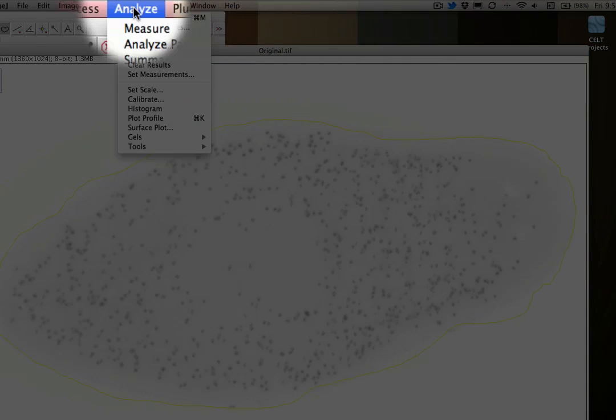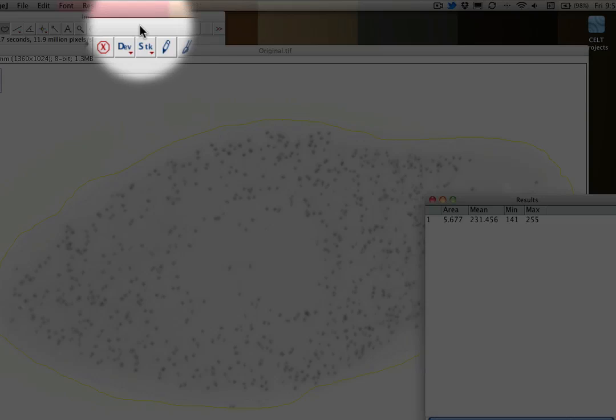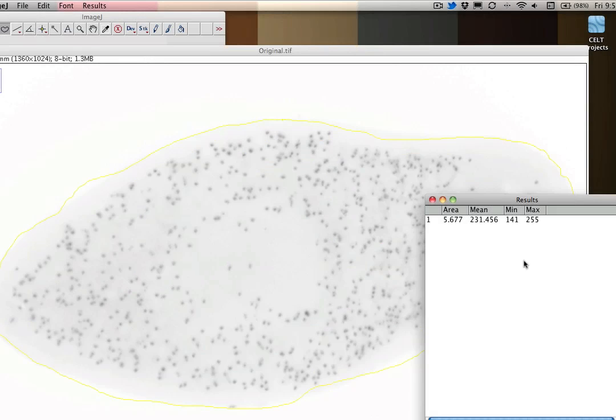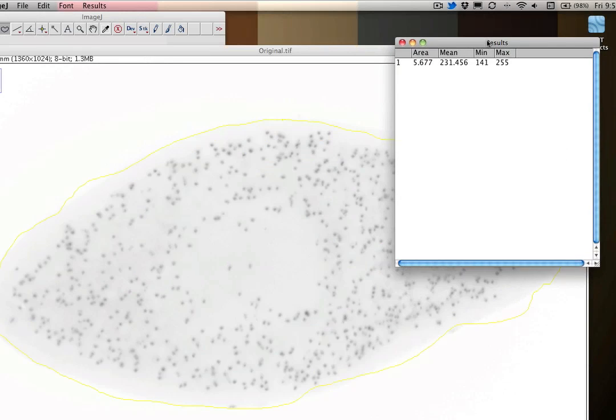Now I can go to the Analyze button and hit Measure. It'll give me a little pop-up window here. Based on the scale I've already set, it will tell me that the area of this particular slide is 5.677 millimeters.